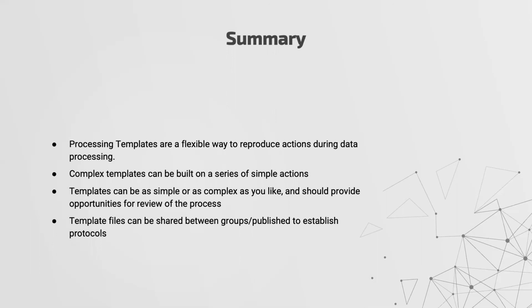You can share them between your groups, you can publish them, you can pop them on the forum if you think that'll help everybody else. The idea was that we didn't want to make templates for everybody else to use. We wanted other people to be able to create templates based on their own ideas.